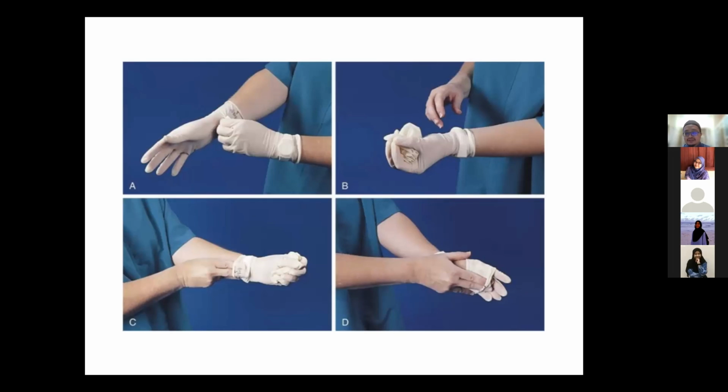Okay, this is how we take off our gloves. The aim is that you wear a glove to protect your skin. So if you look at A, that is the first step. You grab the glove at the wrist area, and then you take it off, and in the other hand you make it into a ball.